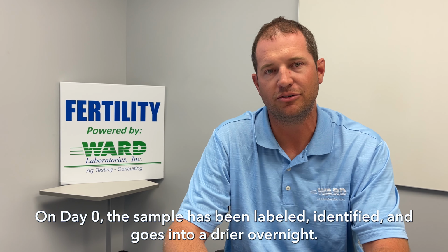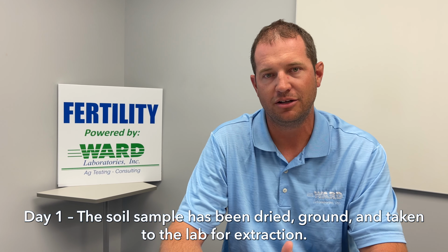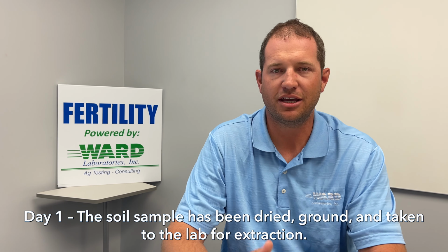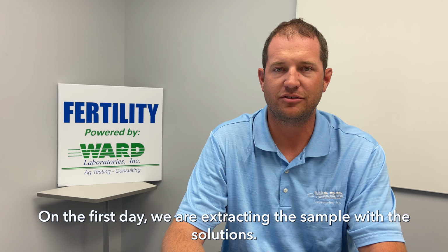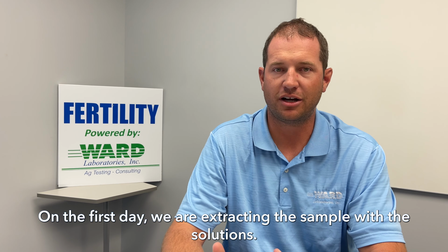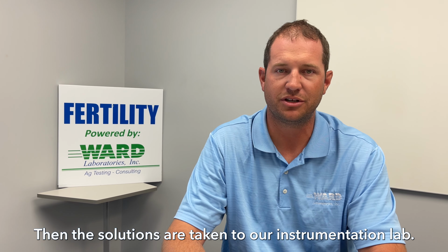On day zero, the sample has been labeled, identified, and goes into a dryer. Day one, the sample has been dried, is ground, and then taken to the lab for extraction and processing. On that first day, we're extracting the sample with the solutions and getting those solutions over to our instrumentation lab. So by the end of day one, we might be actually running the analysis.